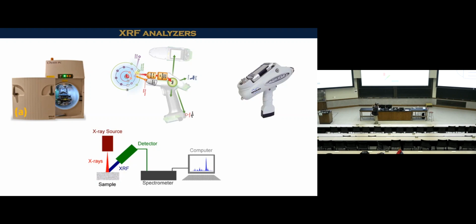Therefore, we have this smaller instrument, which is handheld. You can take it and go to a museum. You can just put it in your hand and then use it. Both these techniques have the same principle. We have an X-ray source inside.